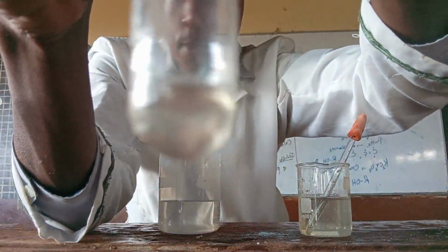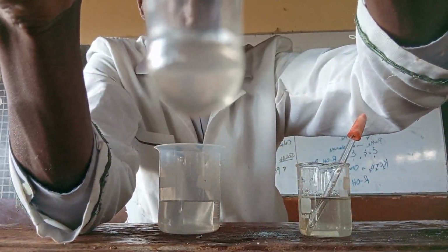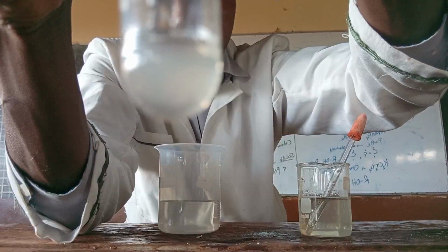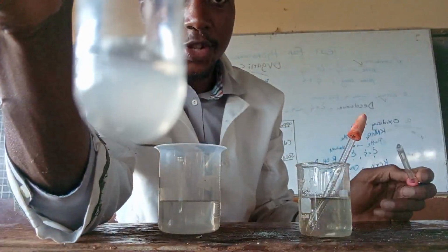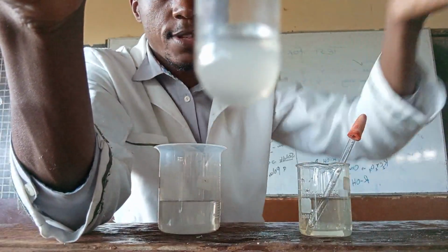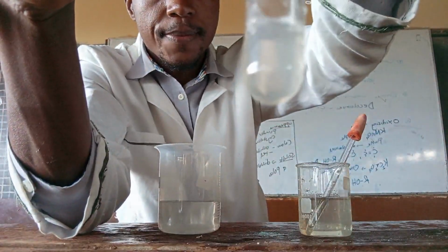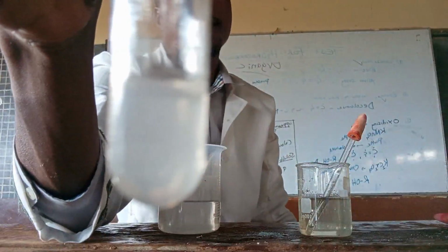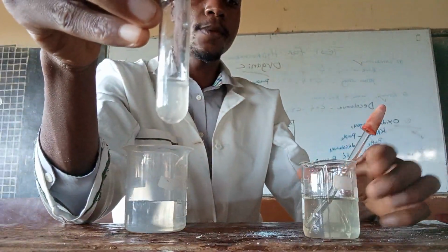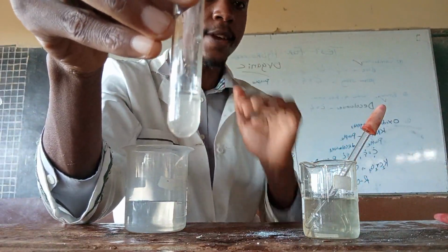You see? 3 drops and the solution is now white. What about if I add ammonia in excess? The white color will never go away. The white color will still persist. So, basically remember, in this sample, there is either magnesium or calcium and nothing else.